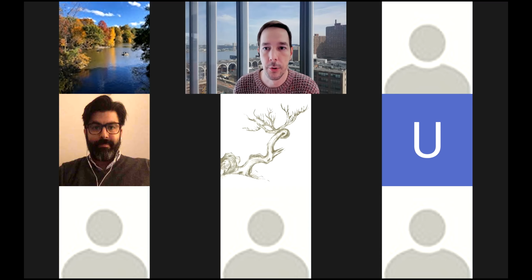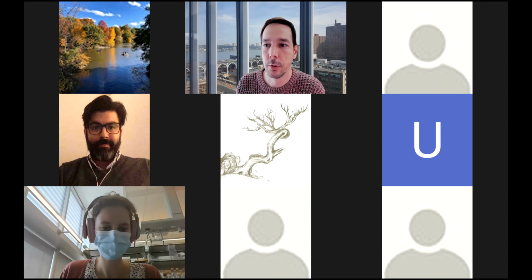And so, just to get started, what I'll do is share the desktop of the workstation at Cellular Imaging, and this will be a PC, but BrainRender can work on PC and Mac and Linux. And okay, so I'm going to share my screen.